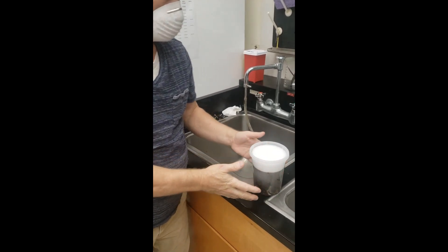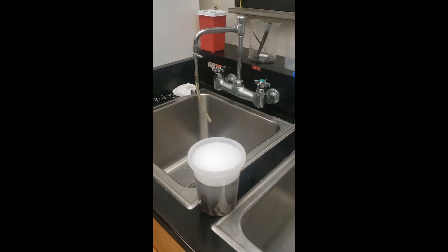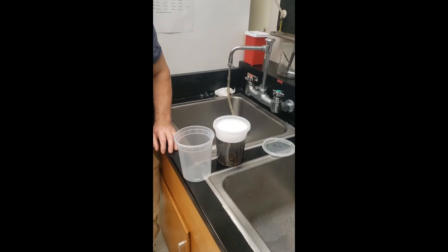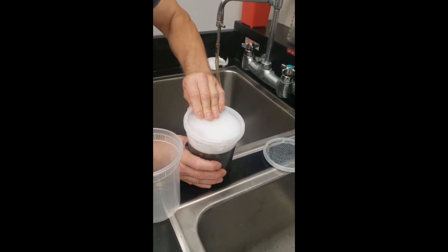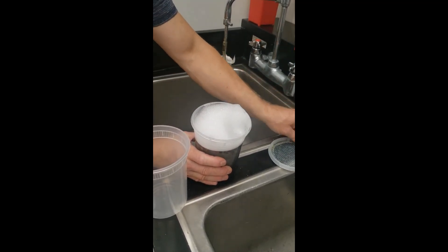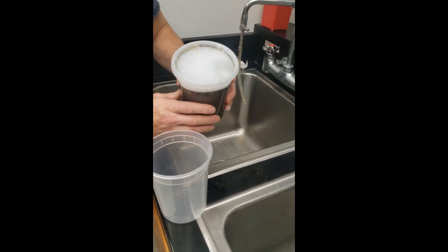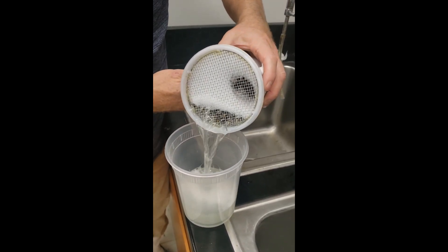We will now let the container sit for a minute to let the mites dislodge, then repeat the shake for 30 seconds, rest for one minute — we'll do that for a total of three shakes. Now that you've gone through your shakes, replace the regular lid with the original screen lid. You might get some foam that comes out — that's okay. Then gently pour it into this extra container.